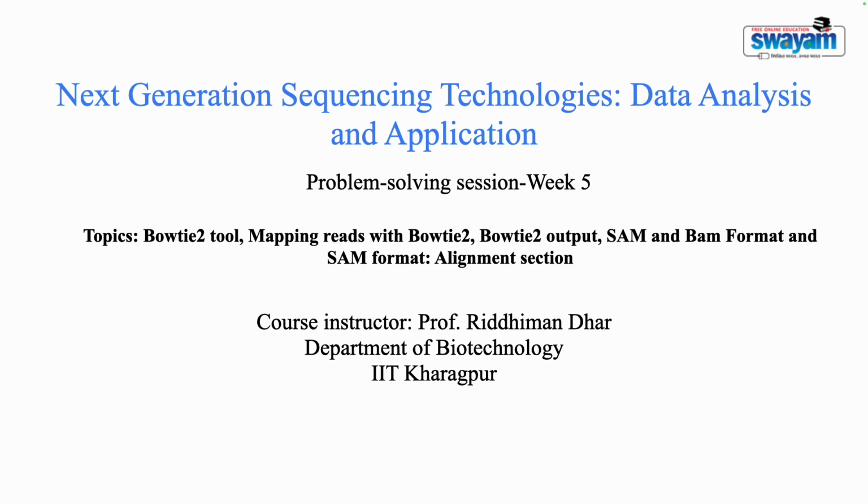Okay, so we'll start with our session. I welcome you all to the problem solving session for week 5. The topics that today we'll be including are the Bowtie 2 tool, mapping reads with Bowtie 2, output SAM and BAM format, and the SAM format alignment section. So the questions that today we'll be discussing are from these lectures. I'm hoping that there will be questions and you need to answer them first, and then we'll see the concepts behind those questions.